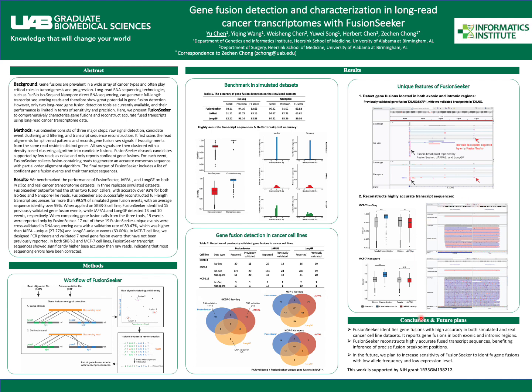So that is what I have for FusionSeeker: we can identify gene fusions with high accuracy using long-read RNA sequencing data, and we can also report accurate transcript sequences, at least more accurate than the reads themselves.